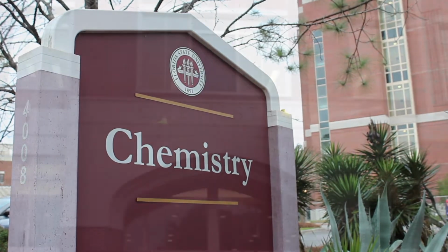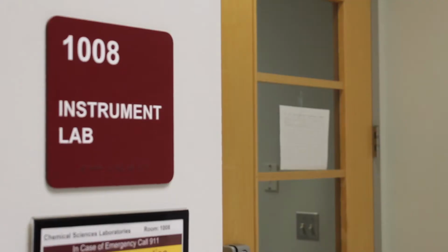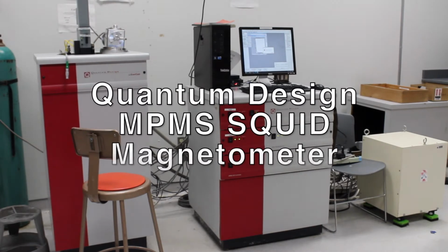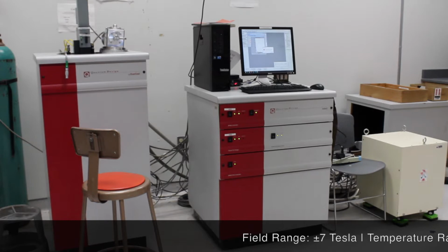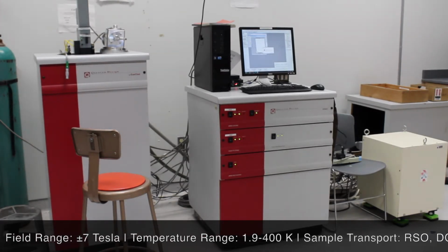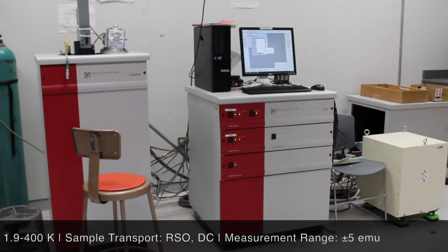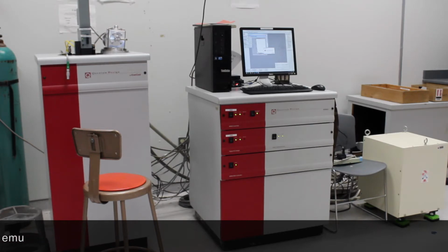Welcome to Florida State University's Department of Chemistry and Biochemistry Materials Characterization Lab, or what we like to call the MAC Lab. This is our SQUID magnetometer. SQUID stands for Superconducting Quantum Interference Device, which is used to study magnetic properties of materials with wide-ranging applications from physics to biology. The magnetometer can resolve magnetic moment changes as small as 10 to the -8th electromagnetic units over wide ranges of both temperature and applied magnetic field. All of these capabilities are fully automated for precise control and user-friendly operation.